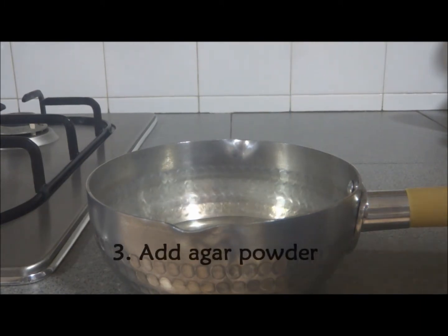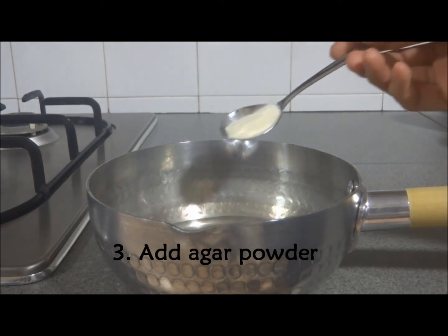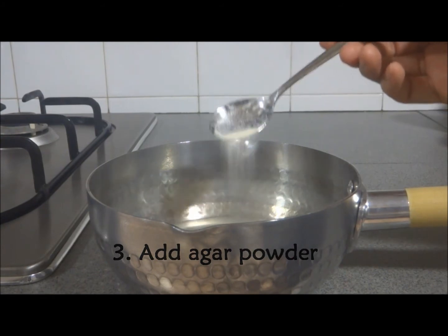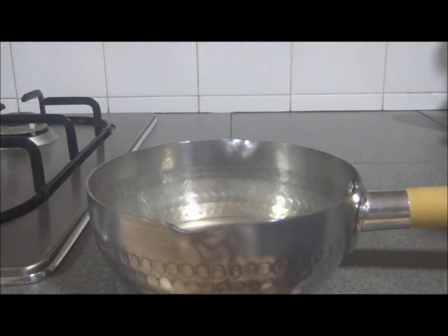Next, add the required amount of agar powder into the cooking pot. As an example, if you wish to prepare 1% agar, you should add 1 gram of agar powder to 100 ml of water.